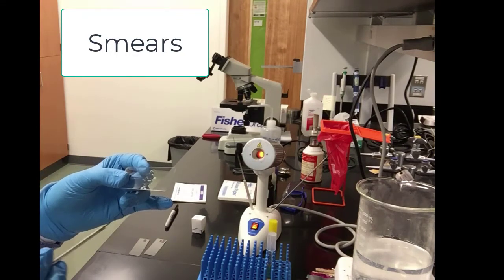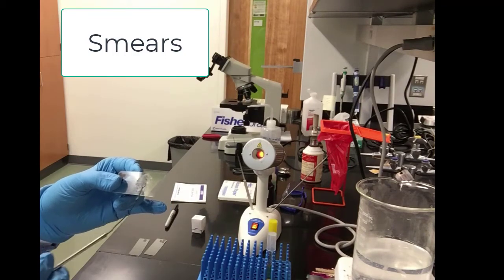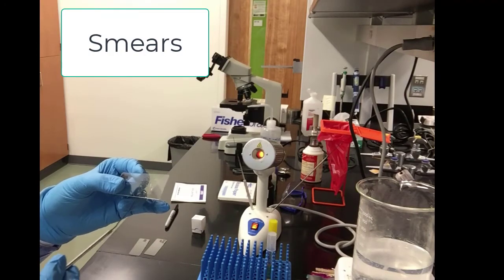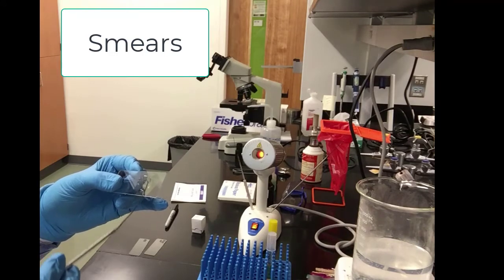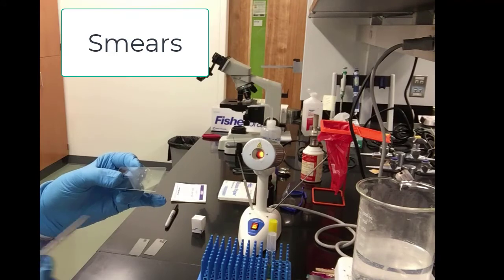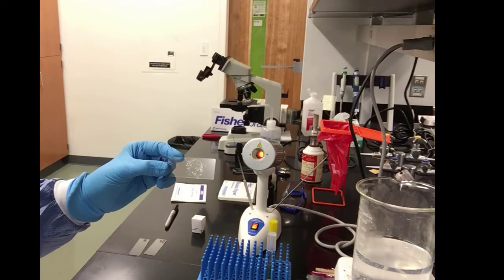So we're going to try our best here trying to break up the clumps. We want to spread out those bacterial cells of Mycobacterium so we can view them under the microscope. But usually we do see the clumping under the microscope. So that is the one smear. You can see that right there.